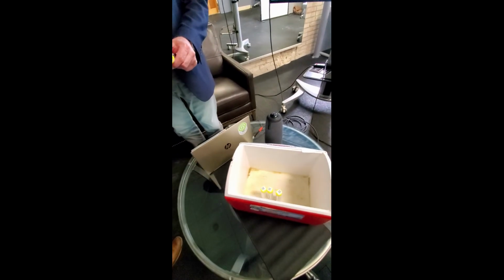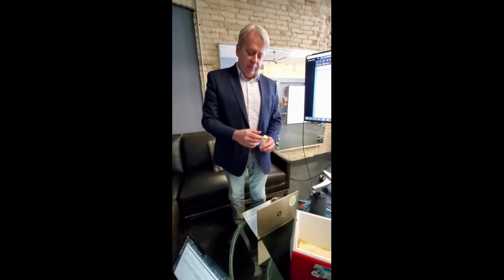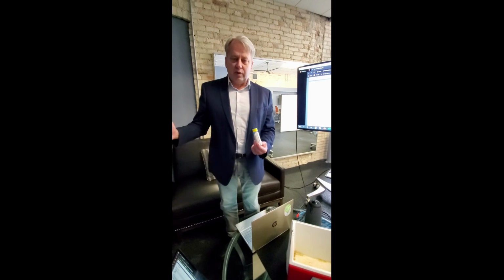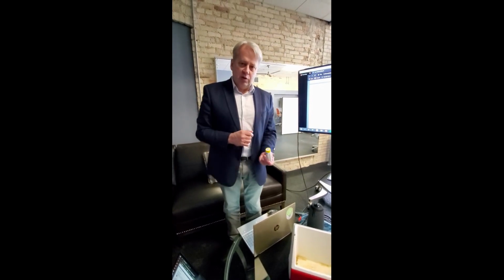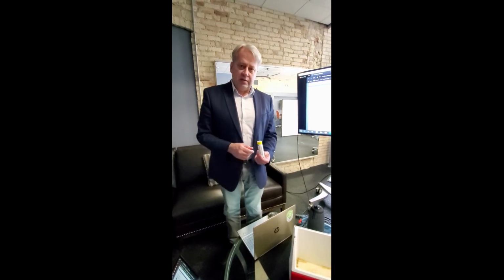Then you can also continue to use this QR code throughout your laboratory process. We're happy to share that information. Each bottle is uniquely ID'd. So if you're doing 3 VOAs, each one has its own unique ID, and you'll be able to use that information throughout your laboratory process as you're moving from one room to another. You'll be able to use that QR code and the augmented reality to track those samples.